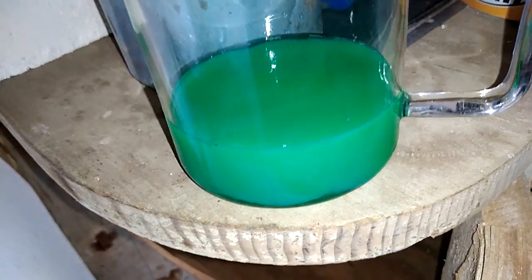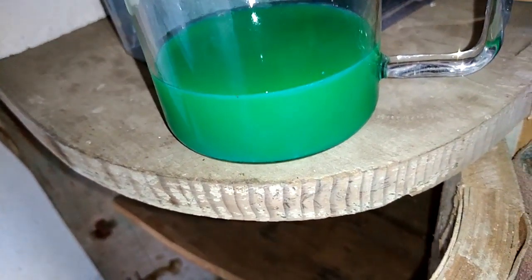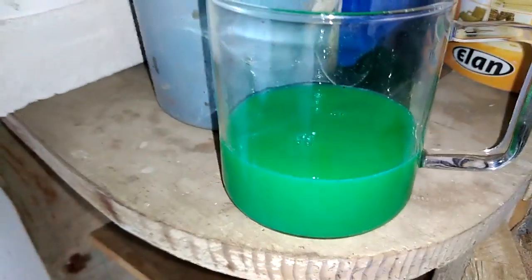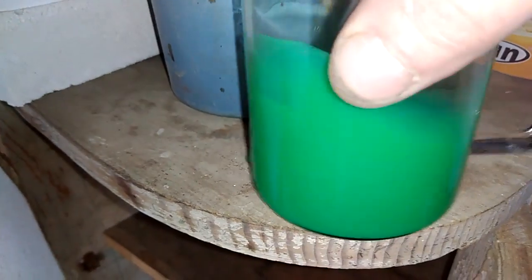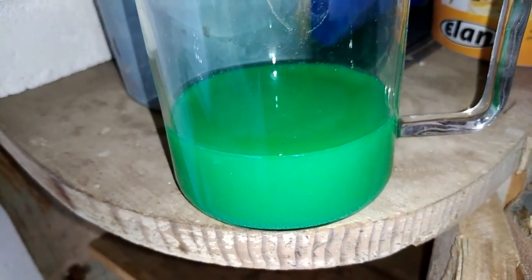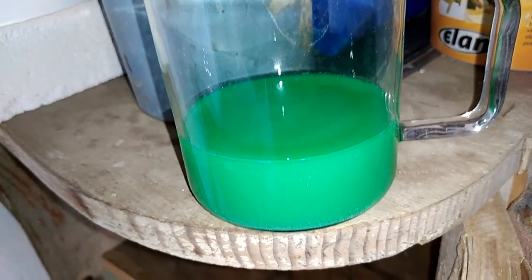Well, maybe just a little bigger amount than expected. Not bad! For this amount of fuses we got quite a lot of silver chloride. Now I will leave that to settle down, filter it, and then melt it straight to see how much we got.